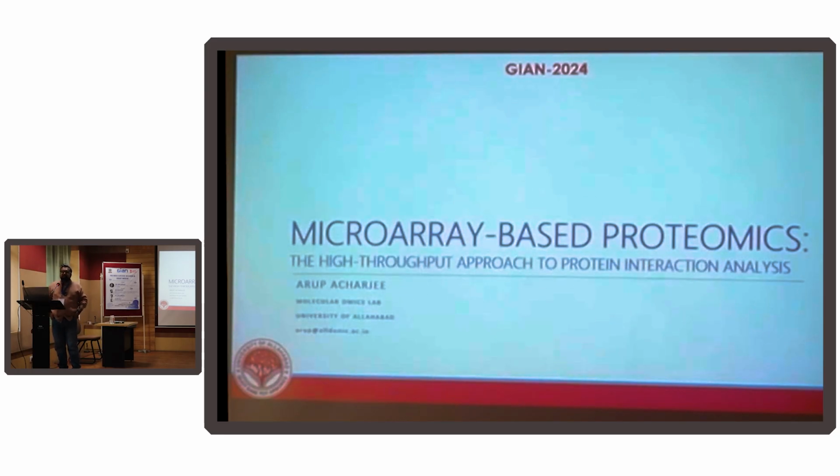Now microarrays, I think the first thing that reminds you about a microarray is that it is something related to DNA. And of course it did start off with DNAs, but now we have all kinds of protein microarrays, and that's what we will be discussing. And we will also tell you, using a case study from the work that we did at IIT Bombay while I was there, how you can use microarray as a diagnostic and prognostic tool.